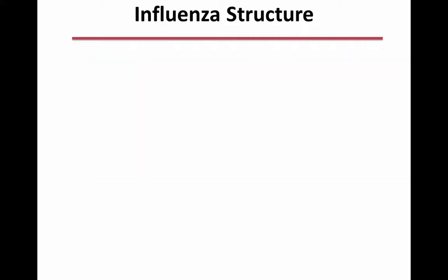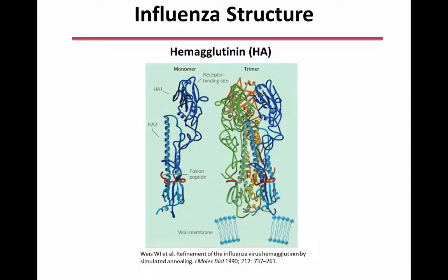When we look at the molecular structure of hemagglutinin, and we're particularly interested in hemagglutinin as it relates to the antibody repertoire, we know that it's a trimer. There are 3 units that make up the protein structure on the surface of the virus, and we also know that certain portions of the sequence vary from strain to strain, and these differences are ultimately what lead to differences in the binding of antibodies from the hemagglutinin of one strain to the next, and ultimately contribute to the need for annual vaccination.